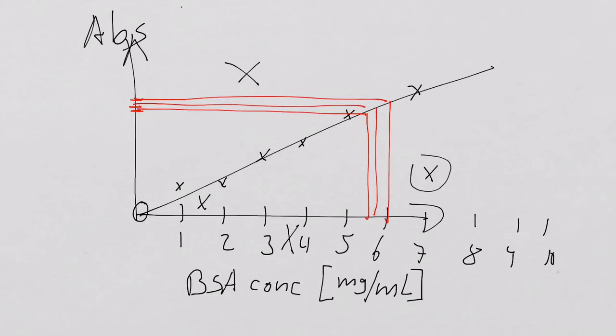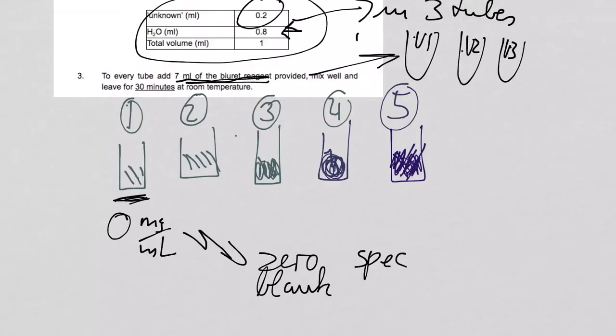And what you can check is, obviously, your unknown samples. That's your unknown sample. In the blueness, it could be, for example, between 4 and 5, let's say. So you can immediately see where your unknown sample is located.